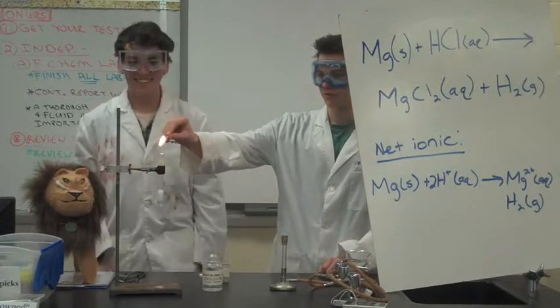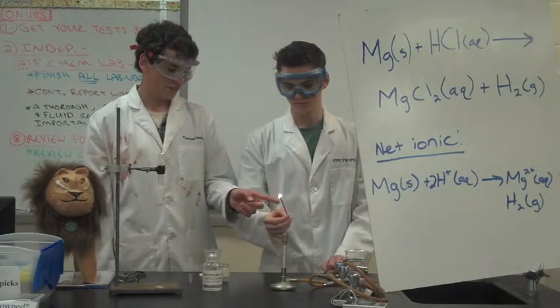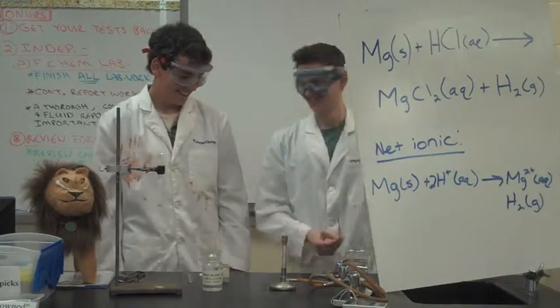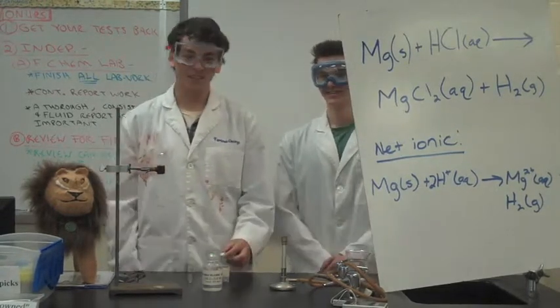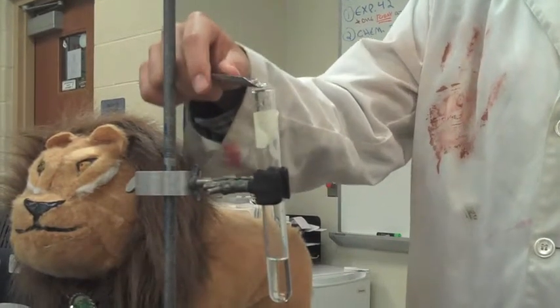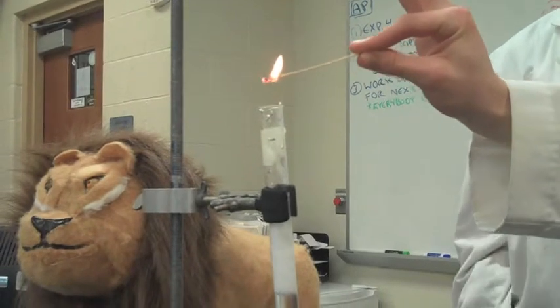And that popping was from the hydrogen gas exploding. There's water there. And now we are adding the magnesium into the hydrochloric acid. And the pop is from the hydrogen gas.